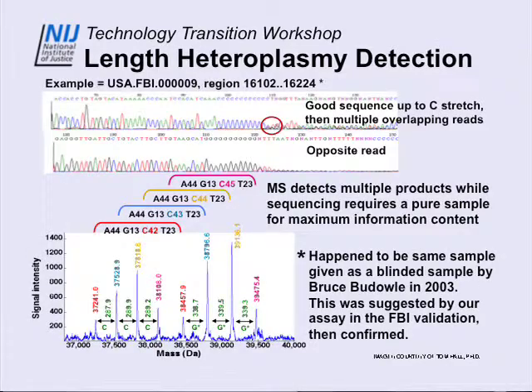When we spray that in the mass spectrometer, using a primer pair that goes somewhere around here to here, it spans this region, what we see is multiple peaks that we can resolve the masses clearly from. If we correlate those peaks to each other, you'll see we can derive a base composition for these two here.